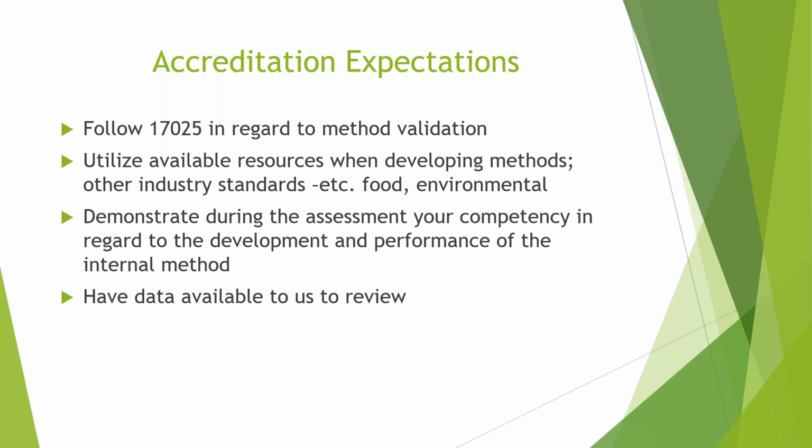We need to make sure that we feel confident that your method has been developed appropriately and it is fit for the use of the test you're performing. And you, as a laboratory, obviously would want that as well. There's a lot of risk that's involved with in-house development, and ensuring that you're doing it as accurately as possible is really important, particularly in this industry. And we, as the accreditor in the cannabis industry, we're not the only ones looking at your data. So many states require data packages to be provided as part of their review. So you want to ensure you're following 17025 and provide them the same confidence that you would provide to us during an on-site assessment.